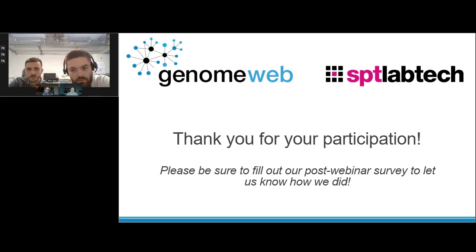Maybe if you go too high and you ask too much of, for example, the SP flow cell, you could have issues like that. But for now, this is not something that we have encountered.